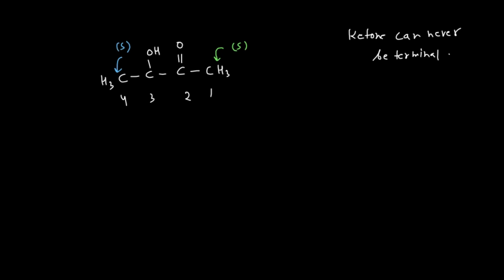Again, you can see there are no hydrogens attached here. No hydrogens are attached here. So one singlet is here, right? And then this singlet again is due to this hydrogen, and because this carbon is connected with the OH group, it should be very downfield. So now if you count the total number of carbons, it is 4 carbons, but we are having 5 carbons.